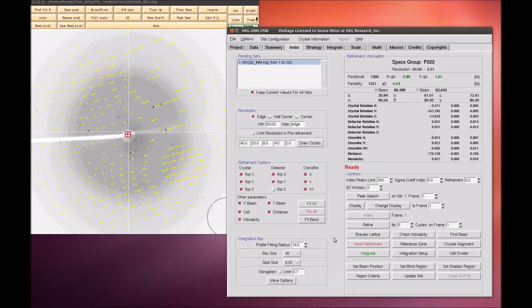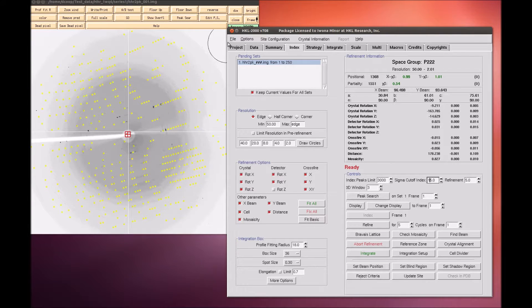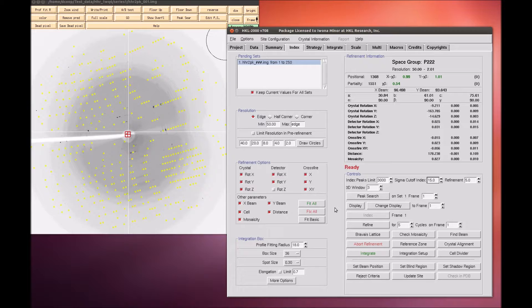This dataset indexes easily, but allow me to mention some things that can help index more difficult datasets. You can increase the number of peaks that are used for indexing, or increase the sigma level used for indexing. Increase the number of frames for indexing by performing a manual peak pick and picking peaks from several frames. See the HKL research video on advanced indexing for more tips.